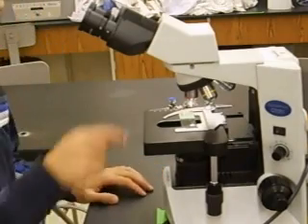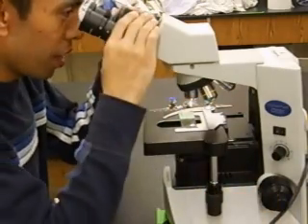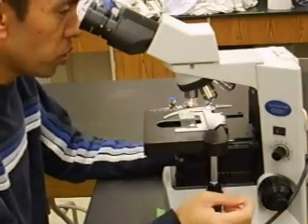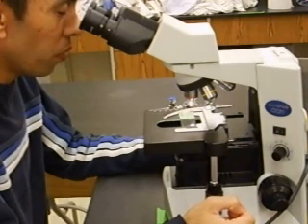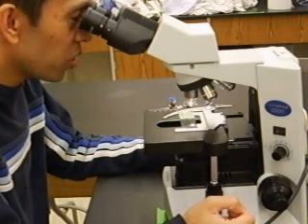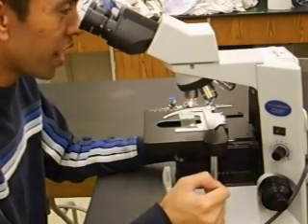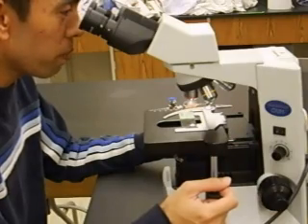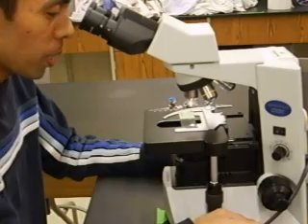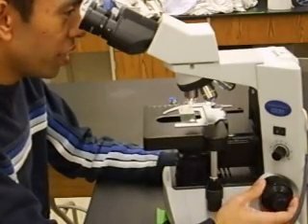Now that the specimen is above the light source, you can take a look. Looking involves peering through your ocular lenses — make sure to adjust the width so it matches the width of your eyes. Be careful not to be too close to the ocular lenses, or you may see nothing or your own eyelashes. Then slowly bring the specimen up using the coarse adjustment knob until something comes into focus.